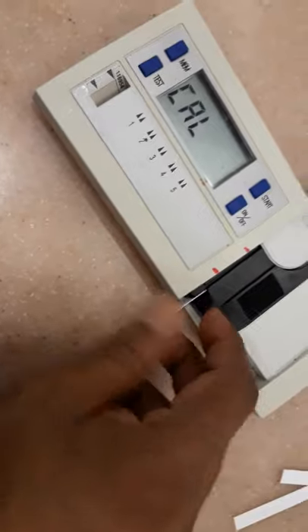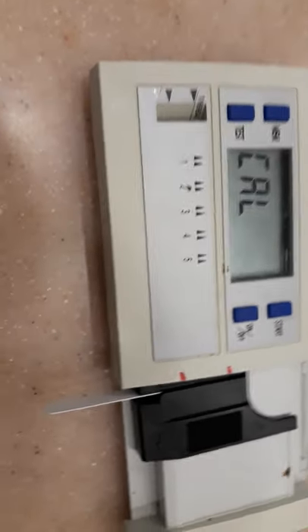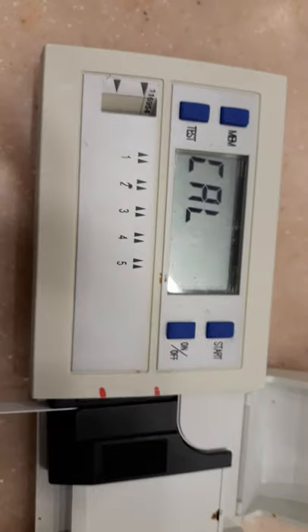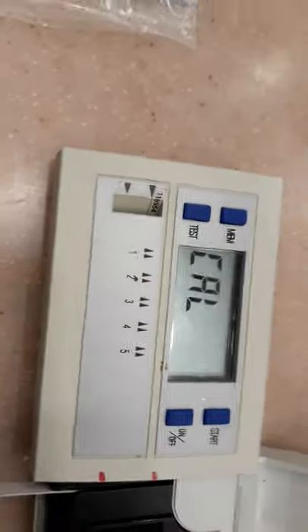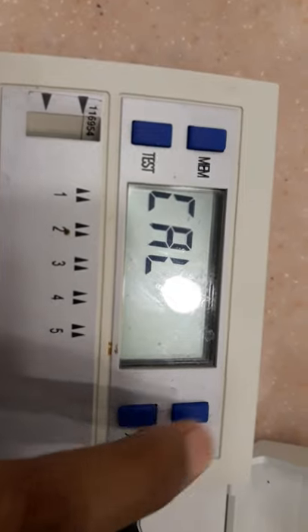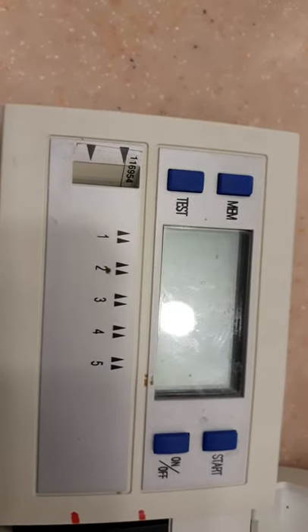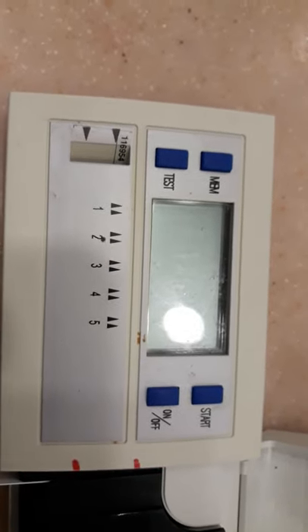Then you need to put this white strip — also called the blank strip — into the strip holder. I have already inserted the blank strip into the strip adapter. Now I will press the start button, and when 'calibration' disappears, it means your arcuflux is already calibrated.